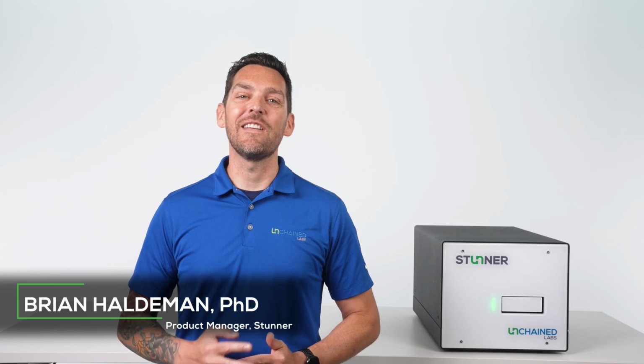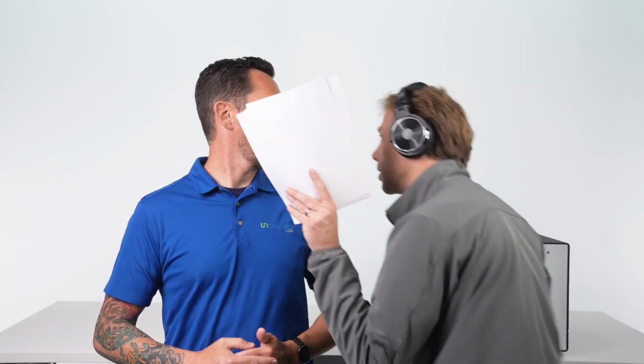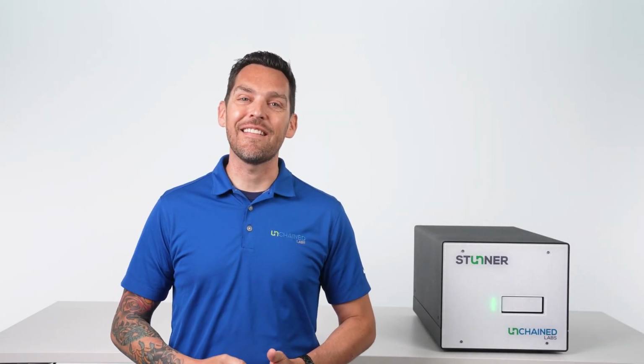Hi, I'm Brian, and I'm here to introduce you to encapsulation efficiency on Stunner AF, also known as Stunner Add Fluorescence, the ultimate nanoparticle quantification and sizing tool.